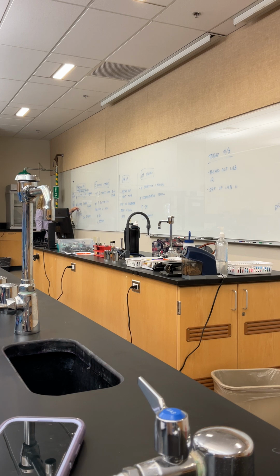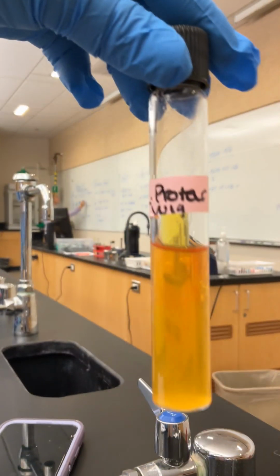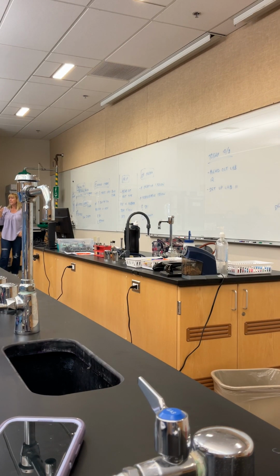All right, let's go to the lactose test. We had E. aerogenes and Proteus vulgaris, correct? Okay. So which organism is showing a yellow coloration? Good, I heard it. Aerogenes. E. aerogenes should be showing a nice yellow color.